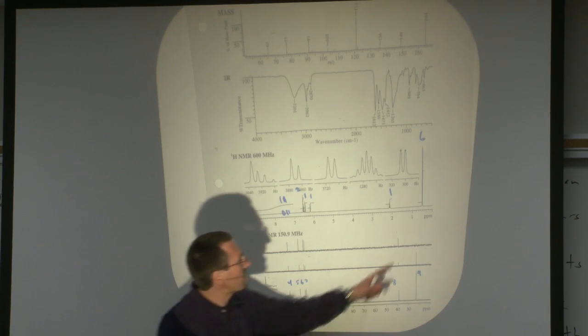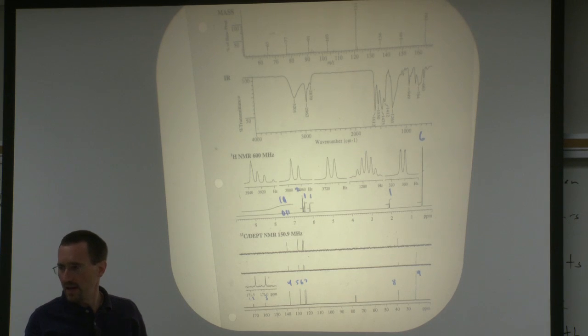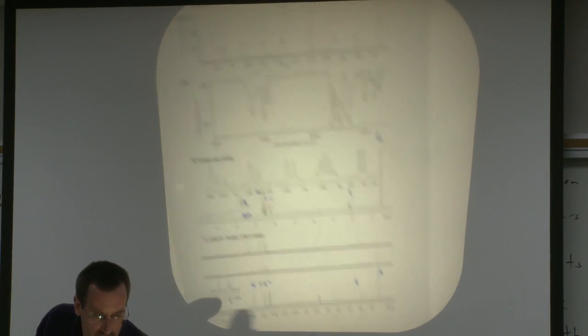With 6, you might even think about what that means in terms of the structure of the molecule. I'm going to take us on to the INADEQUATE. And honestly, you can pretty much just by inspection with the INADEQUATE put the thing together, and then you're going to have to use your head a little bit to think about what's going on.